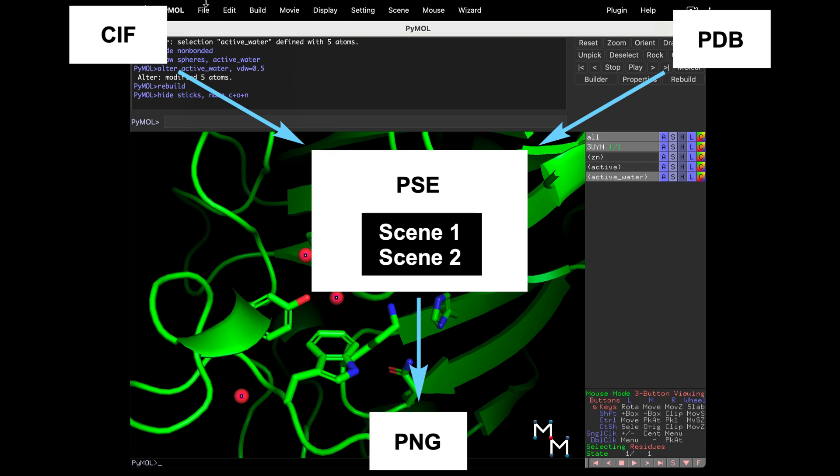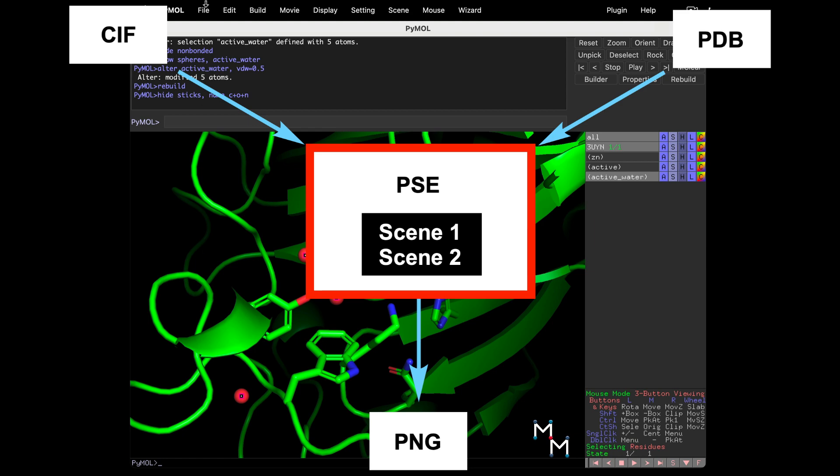This saves a PyMOL Session file, with a .pse at the end of the file name. PSE files open in PyMOL and can be shared with others helping you create images.